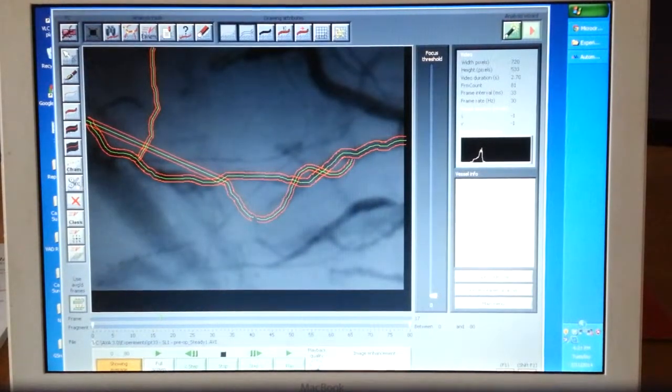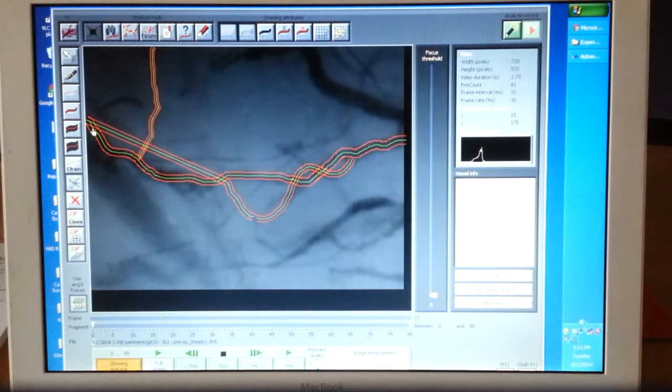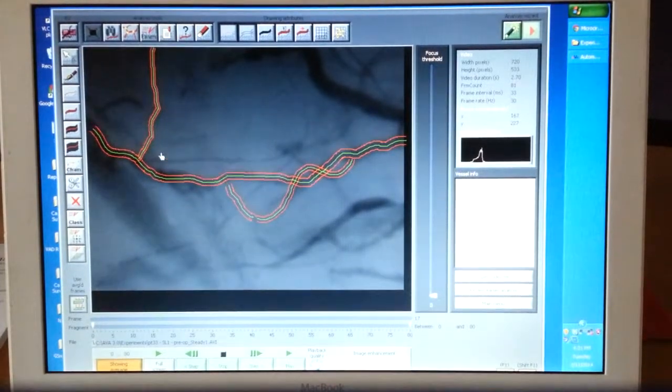So instead of doing that, what I do is I use the scissors. I take the scissors and I say, okay, this is where it started chaining. I click here, it makes a little cut, and then I say, okay, this is where it chained it to improperly. Obviously, this is an improper chain, and I click about right here. So then, once I take this X, I basically click in between my two cuts, and it only gets rid of that segment, okay? So you don't lose all your work. It's just a little trick that I picked up, okay?